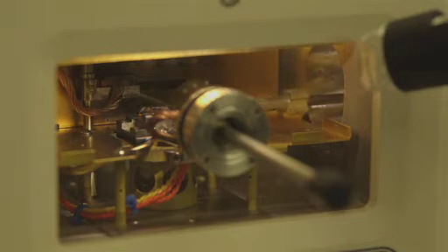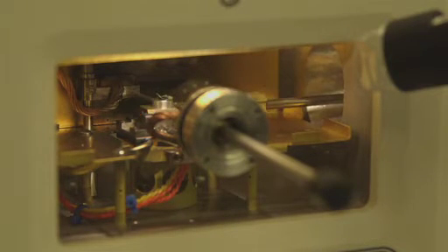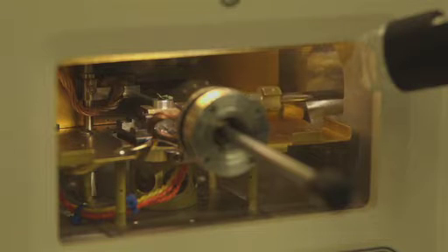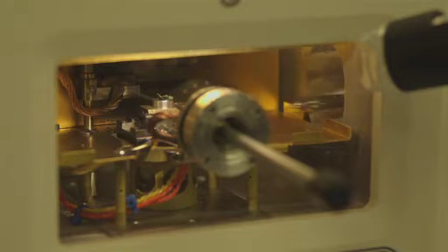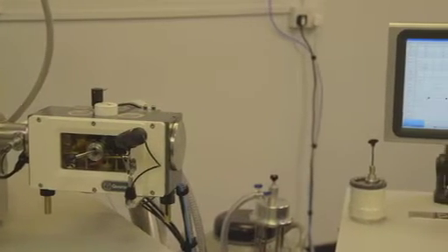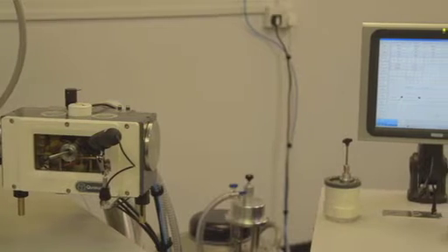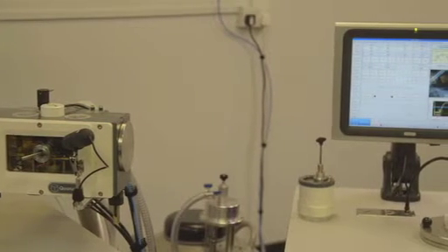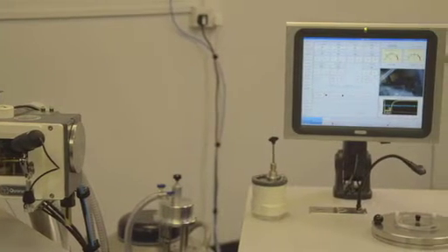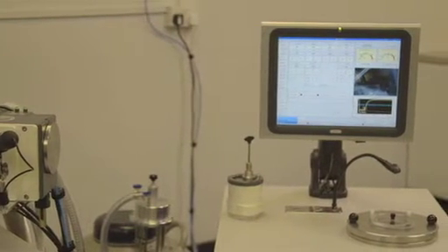The market-leading 3010 from Quorum combines the highest quality results with unparalleled ease of use. The 3010 is a highly automated, column-mounted, gas-cooled cryo-preparation system suitable for most makes and models of SEM and focused ion-beam instruments.